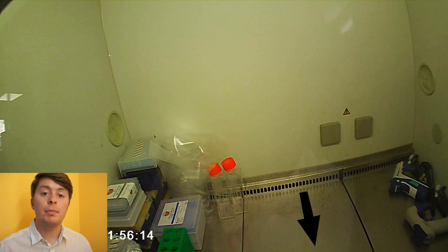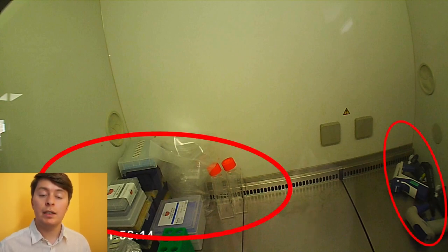Most cell culture hoods work by using a sterile air shield to stop bacteria entering from outside by creating this positive pressure. So things are always pushing outwards, and that's disrupted if you have things like pipette tips, the cell culture media, falcon tubes, or anything that may block that path of air traveling across our cell culture hood.